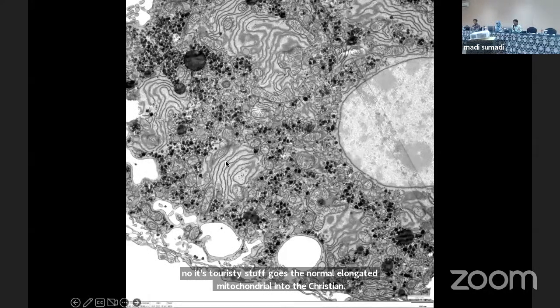See the Golgi? Very clearly, beautiful here. Nice mitochondria. And that's what you see here. A stripe is going on here. I put them intentionally here. What could the stripe be? So this is an artifact. When you cut with the knife, sometimes the knife also has layers, right? The tissue shows this, and this is what you see here. Of course, for a publication you don't put this kind of image, but for understanding you can, and this very often occurs.